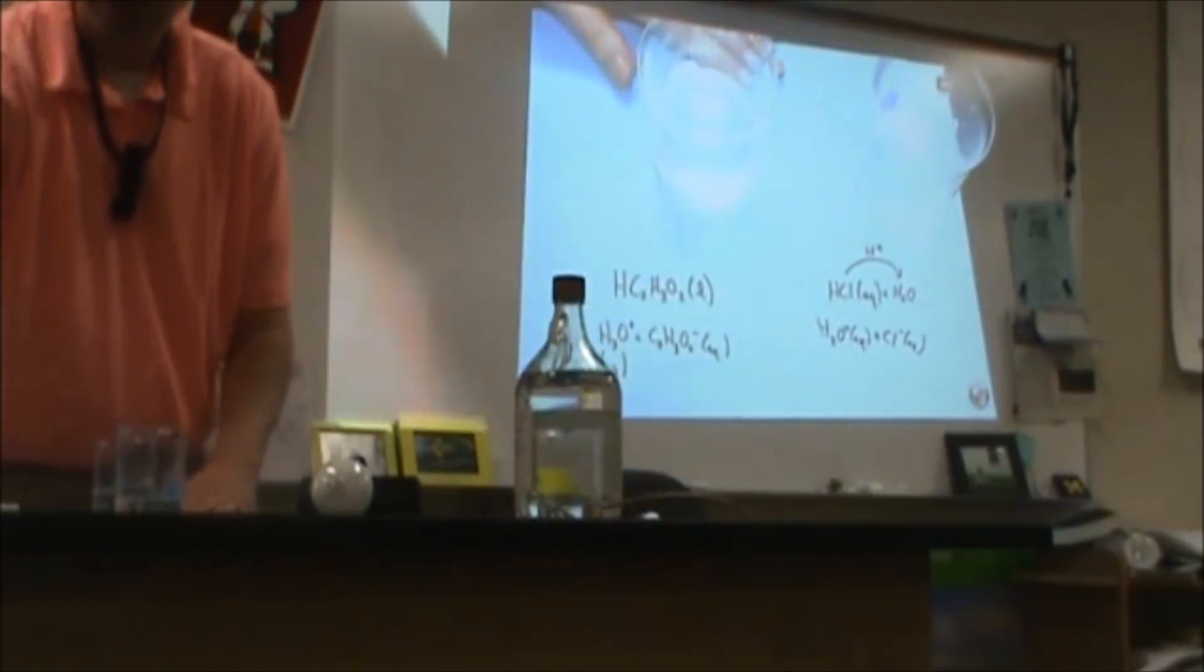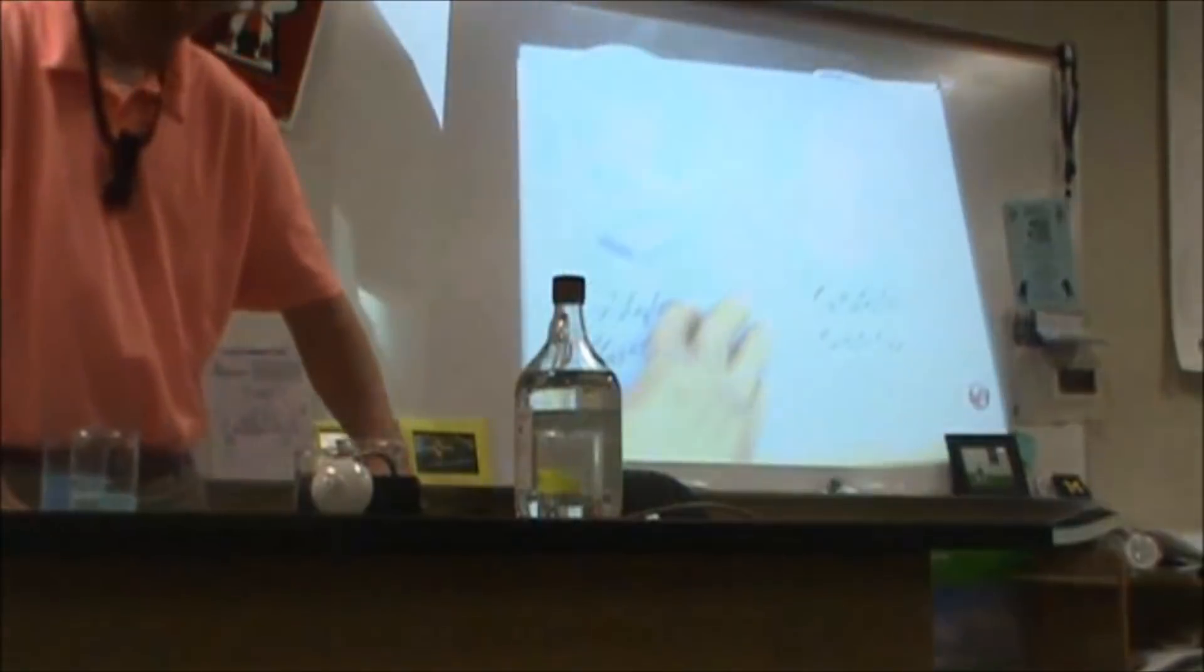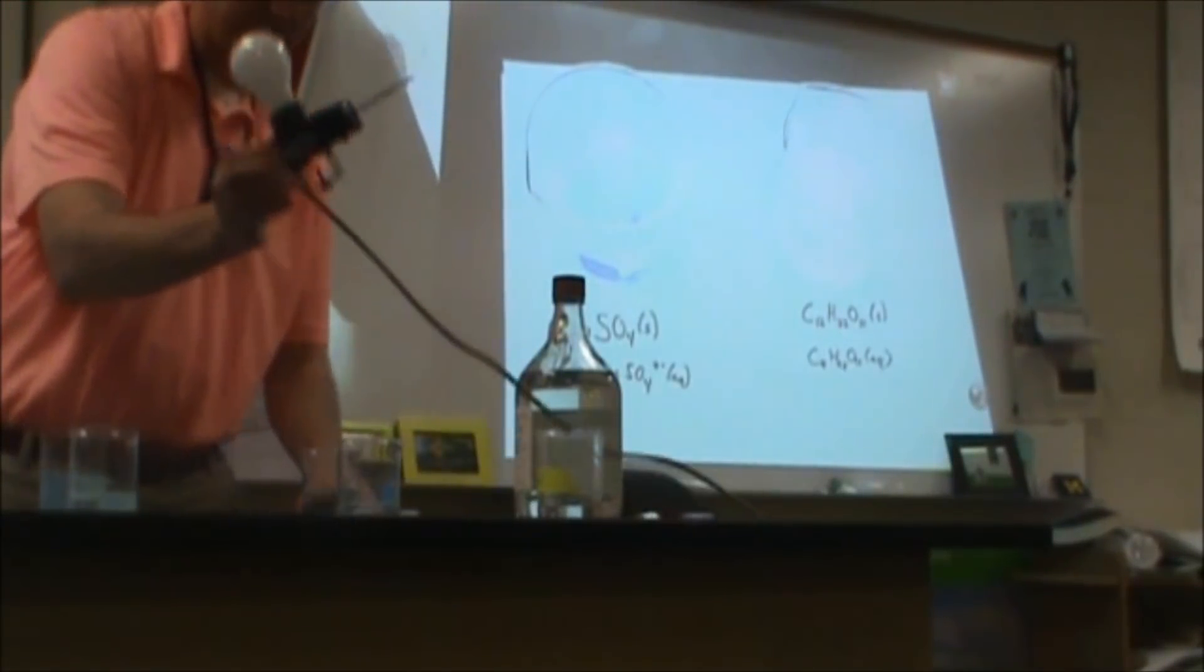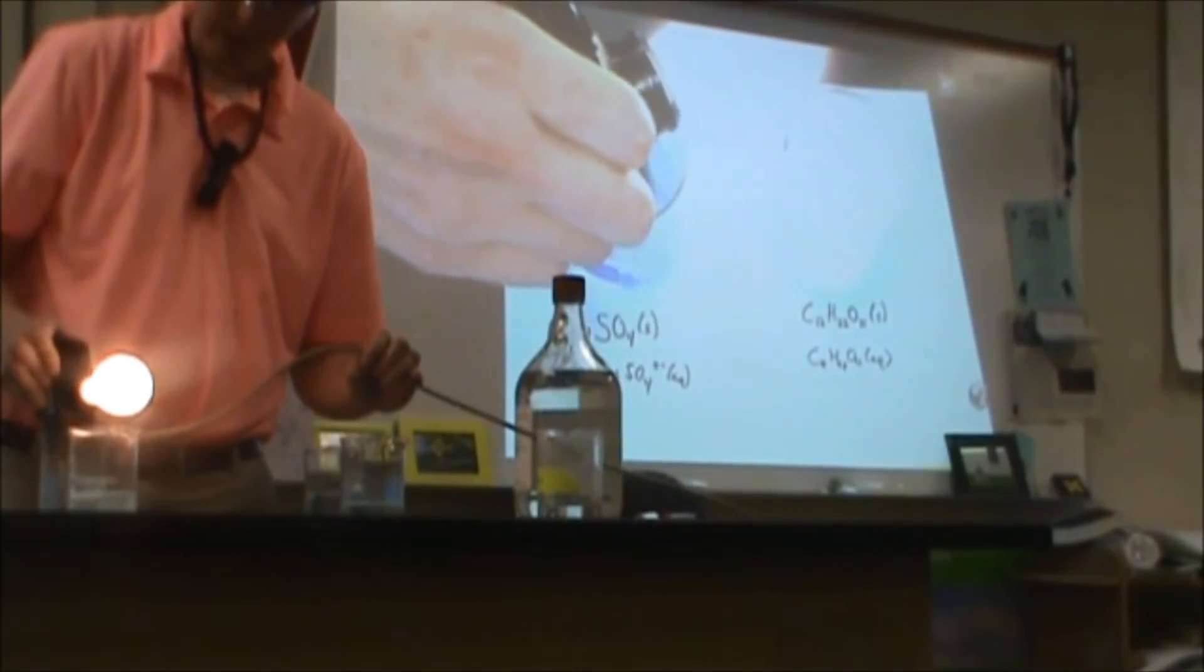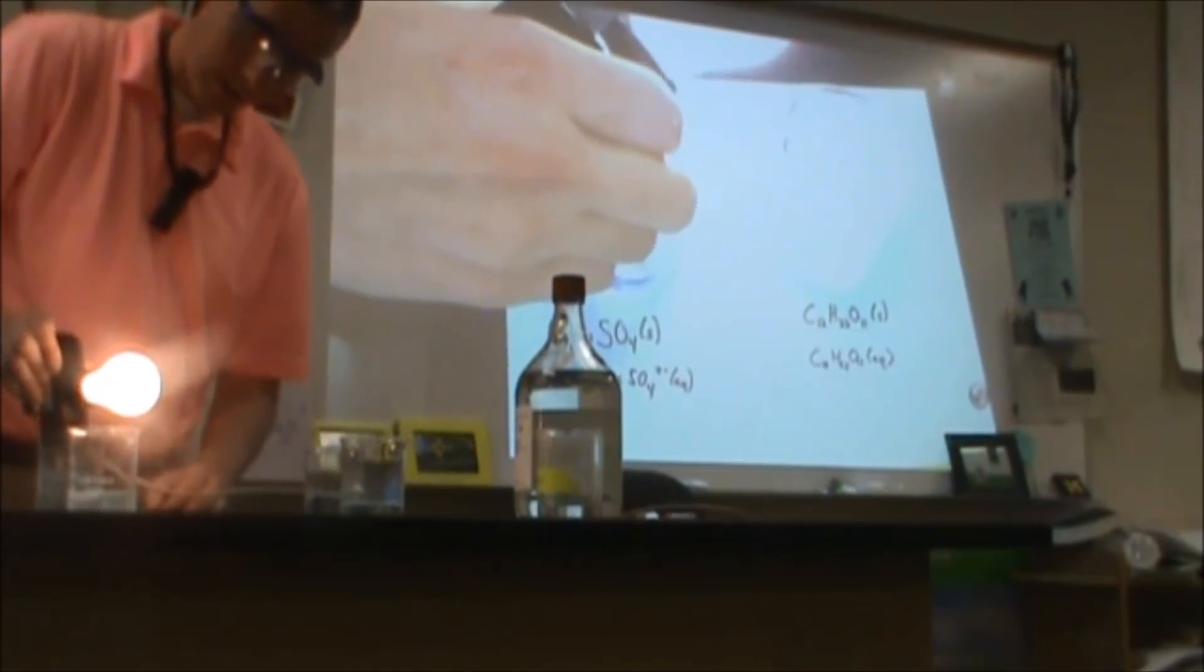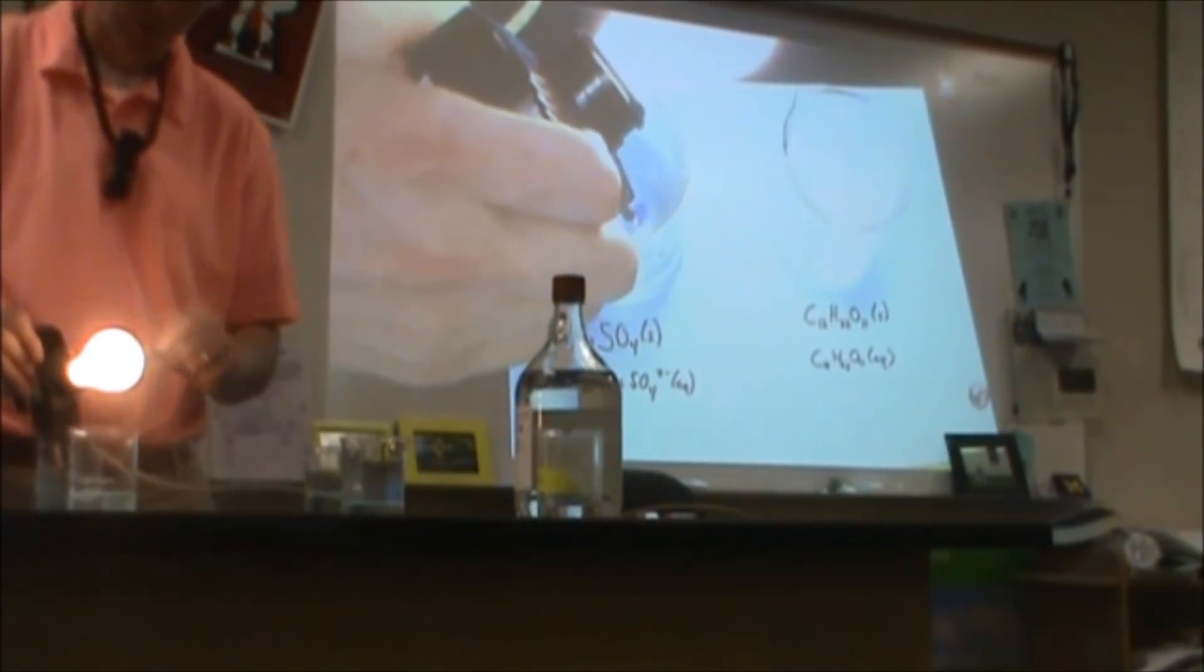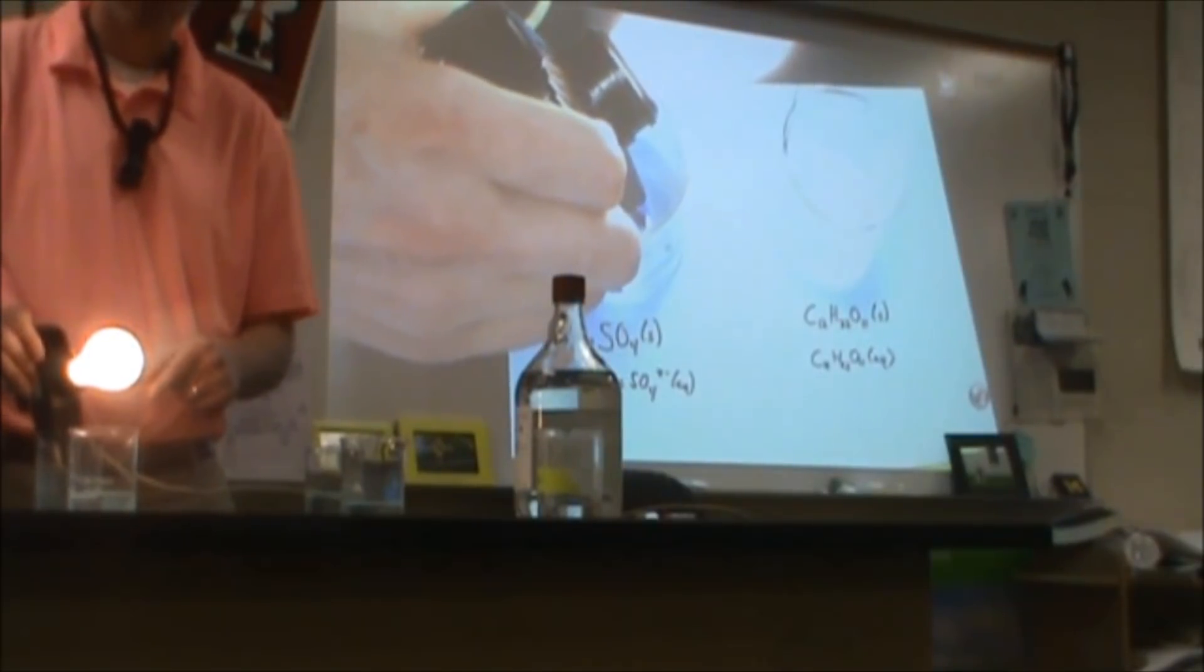If I go back to my copper sulfate from earlier, by now, hopefully, quite a bit of this has gotten a chance to dissolve. We can see that our light bulb is indeed brighter. You can see a blue color to this because more and more of that copper ion is being dissolved in the water. Therefore, we have more charged particles capable of moving, and we get a better conduction through that light bulb.